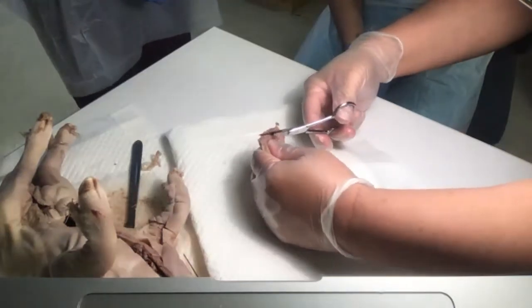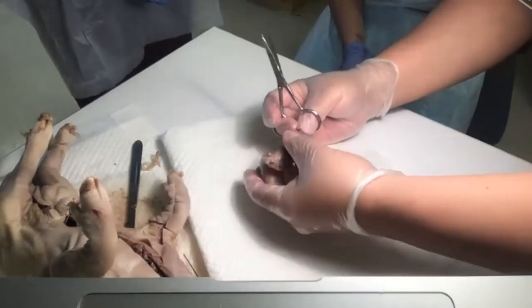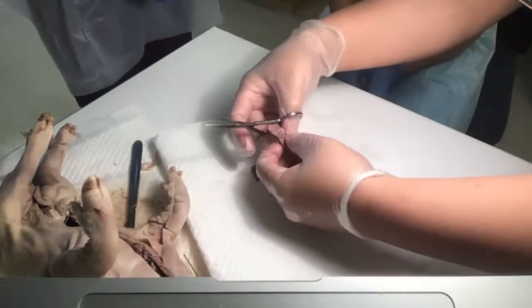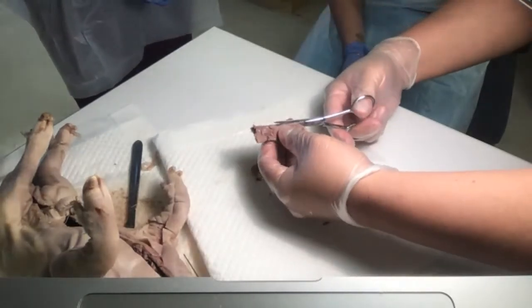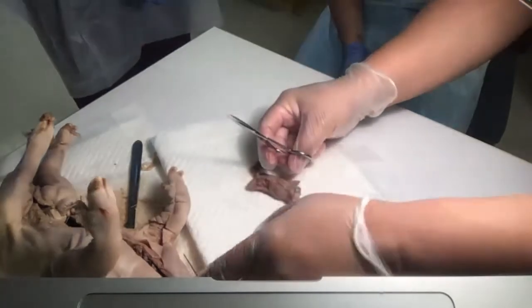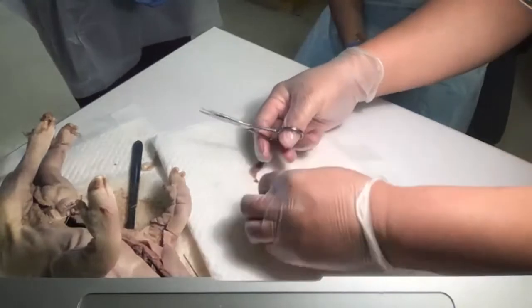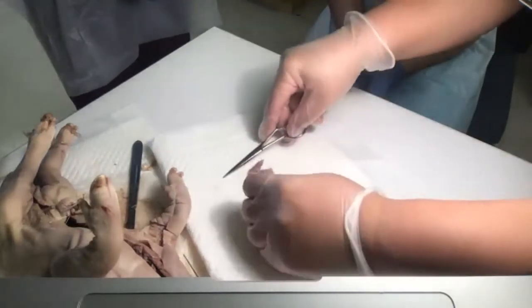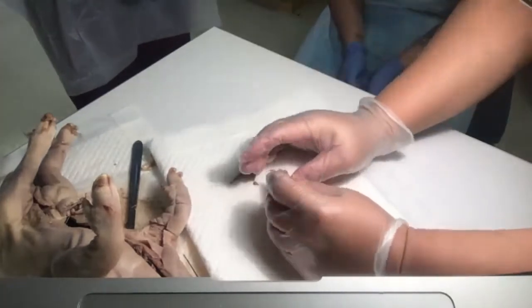Let's just take this out. So let's look at it and then let me clean it up. So this is the larynx. Yep. Larynx, which is our voice box. And of course here, the upper part is our pharynx, right? Which is the throat.